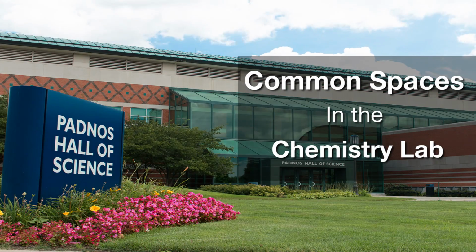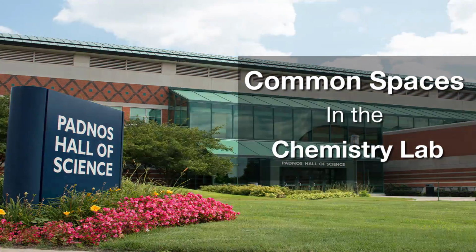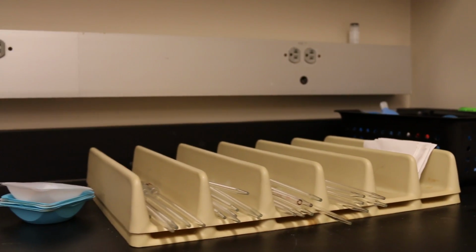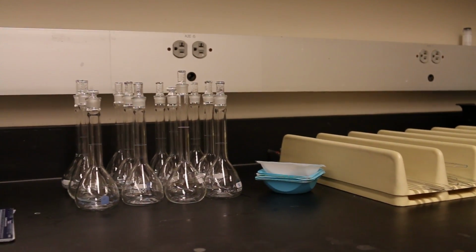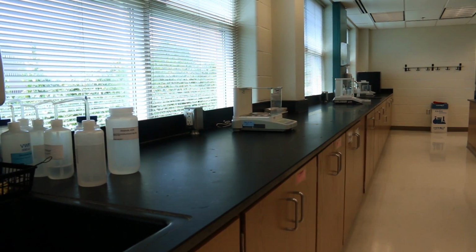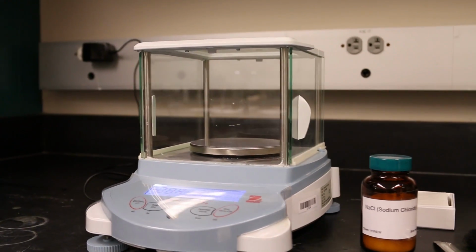This segment will show you more of the common spaces in the lab, where you will find chemicals and other materials. We already mentioned the side benches for distributing special equipment, materials, and chemicals. On the side benches, you will also find analytical balances and lab balances. For most of you, either balance will work just fine. The difference between the two is that the analytical balance is more precise.